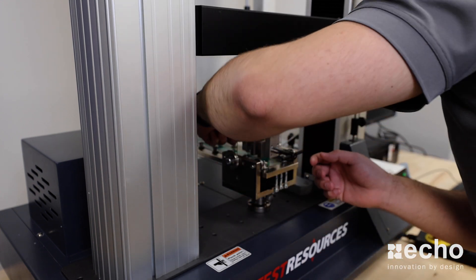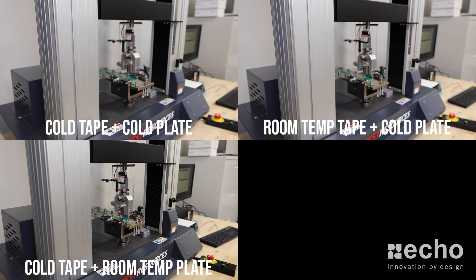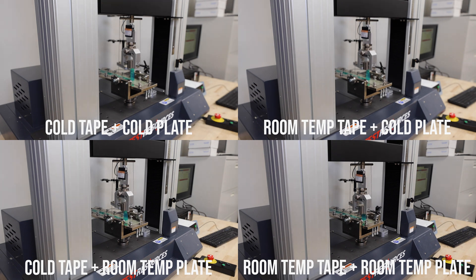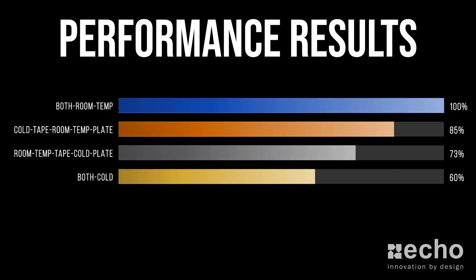The first test we performed used a roll of tape and a metal substrate pulled straight out of the freezer — our way of simulating wintery conditions. After that, we tested room temperature tape on a cold substrate, followed by cold tape on a room temperature substrate, and finally room temperature tape on a room temperature substrate, which we consider the ideal scenario. After performing all four tests, the results were clear: comparing the room temperature scenario to the wintery condition scenario, there is actually a 40% drop in adhesion performance.